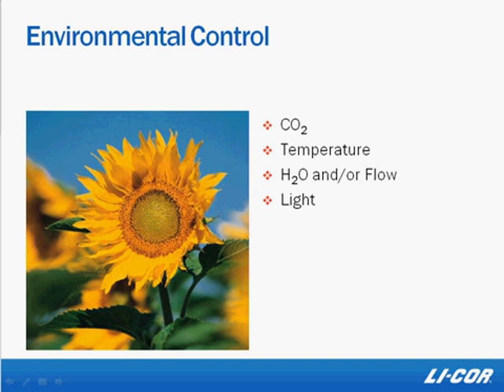In terms of temperature, we want temperature to be ambient, but keep in mind that we do have a diurnal temperature cycle, and it will probably have an impact on your plants. You might consider setting the temperature to a constant value, which would warm your plants up a little in the morning and cool them down in the afternoon.